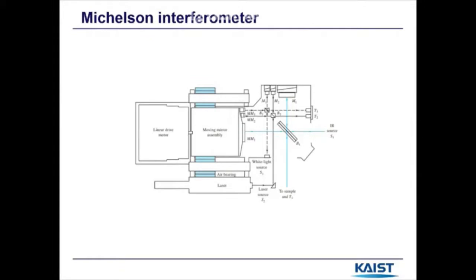The resulting interference pattern that is not directed back toward the source is typically directed to some type of photoelectric detector or camera. For different applications of the interferometer, the two light paths can be of different lengths or incorporate optical elements or even materials under test.